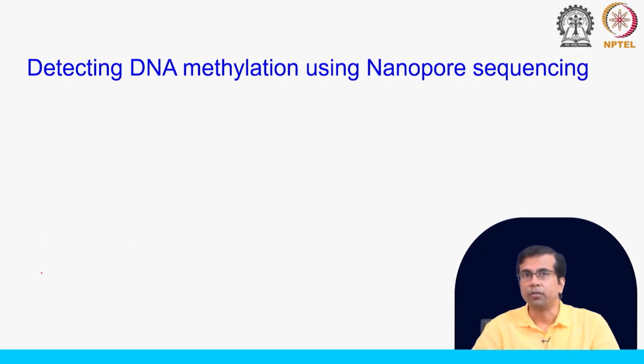Now, let us move on to nanopore sequencing and how you can apply it for detecting DNA methylation. If you remember, in nanopore you have these channels through which the DNA molecule passes and changes the current. There is a current at the picoampere level going through the nanopore, and the moment DNA enters, it changes the resistance, and that alters the current. This change in current signal is detected by the detector, and then the base call happens. We talked about this in detail in the beginning.